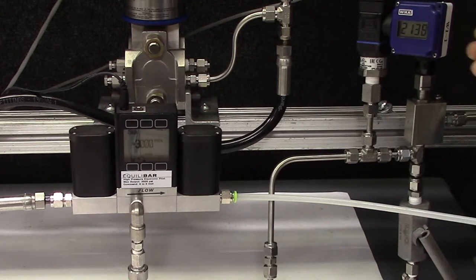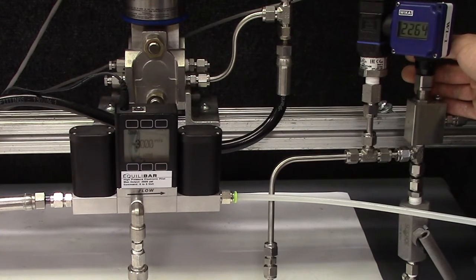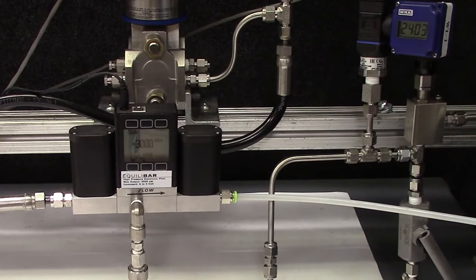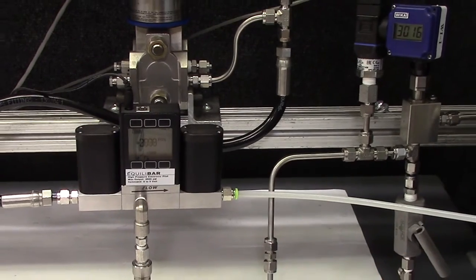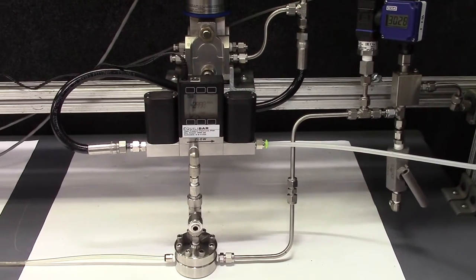Here, the inlet pressure is slowly building. The build is a function of the flow rate of the system, so we'll increase the flow rate to demonstrate a faster build. As you see, the inlet pressure is quickly climbing, and once it hits 3000 PSI, it will stop and remain constant due to the pilot pressure being at 3000 PSI also.